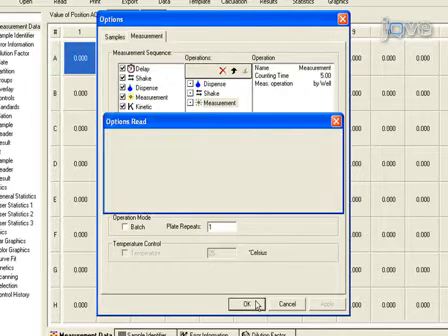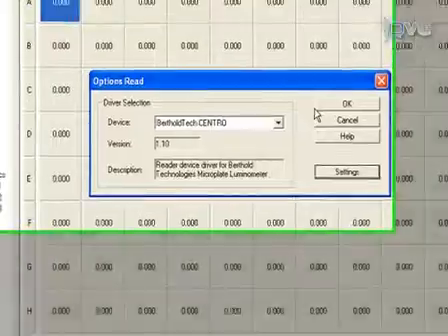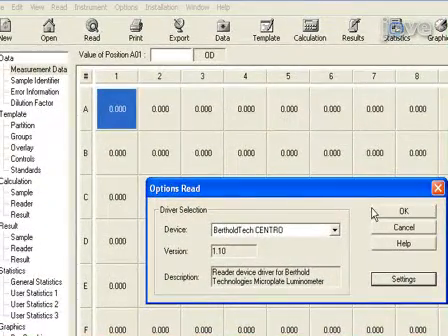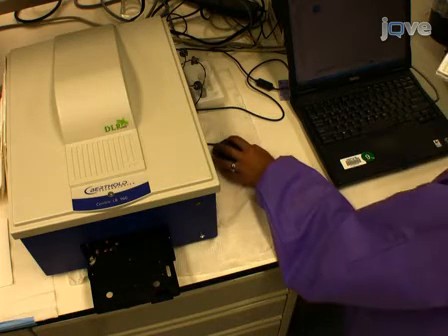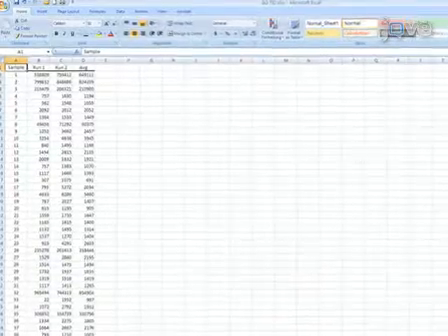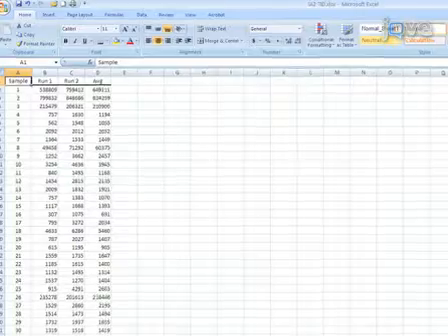Start the program which initiates reading of the plate. After the run, remove the microtiter filter plate promptly to prevent spillage in the luminometer. The data is automatically exported from the MicroWin program into an Excel format for further analysis.